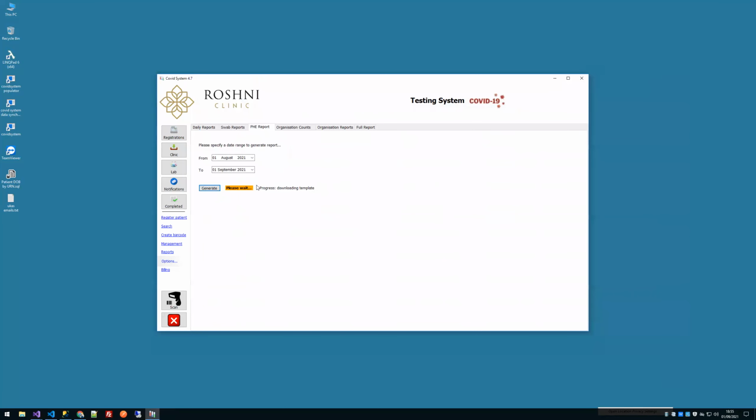Yeah. Just another quick point, actually. We just got an error generated from this because we couldn't find the template. Now, all errors are generated and sent to me, so I can see if there's something I can do to solve your problems even before you report them to me or my team. So there's other sort of stuff you can get, all sorts of other reports.